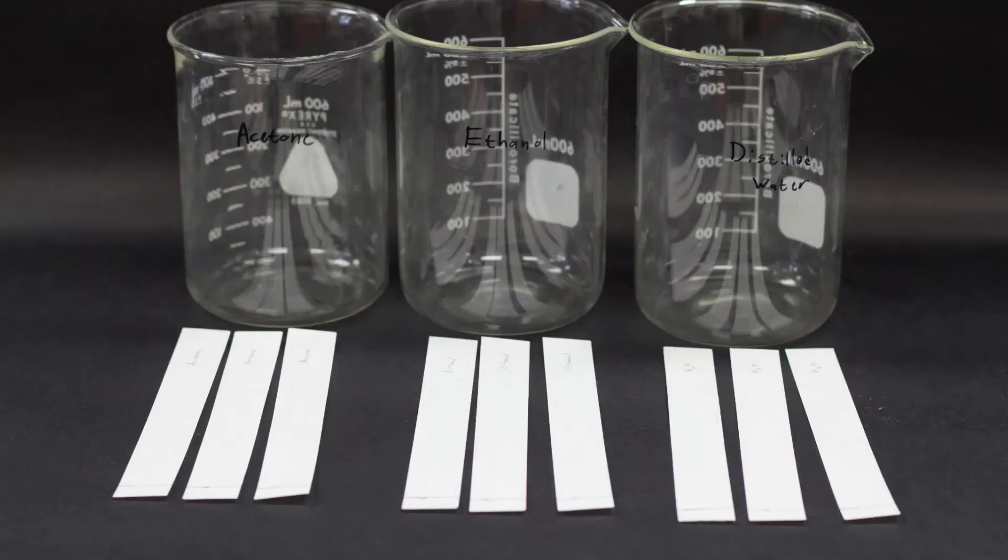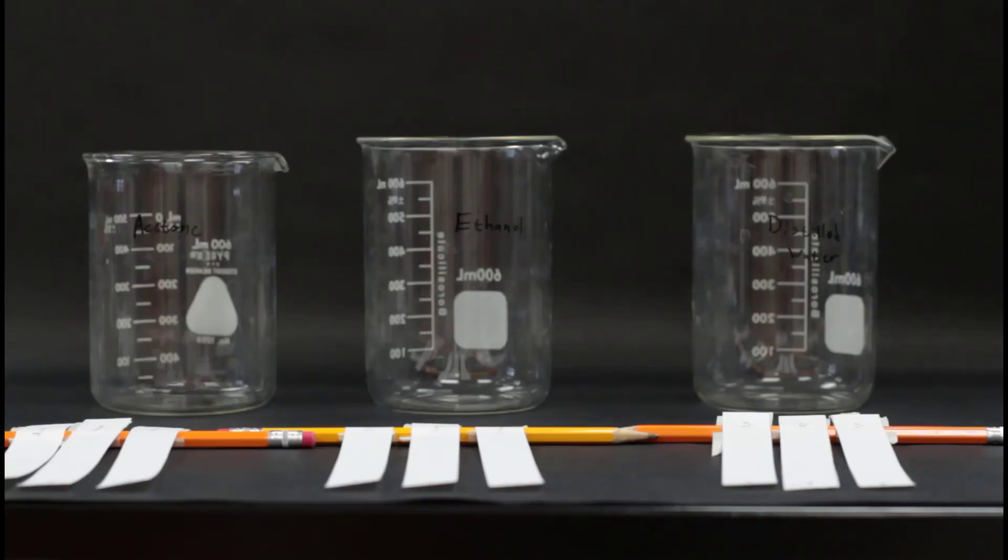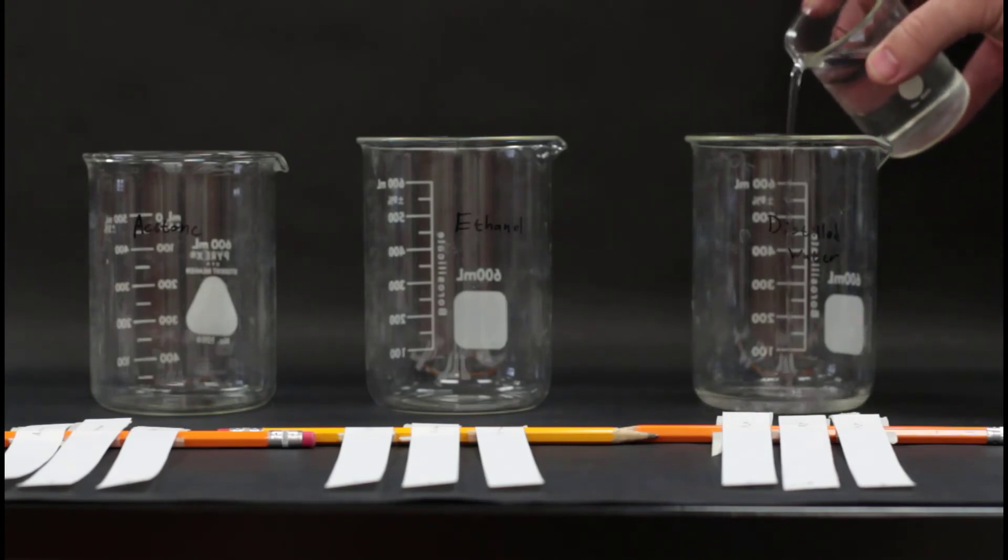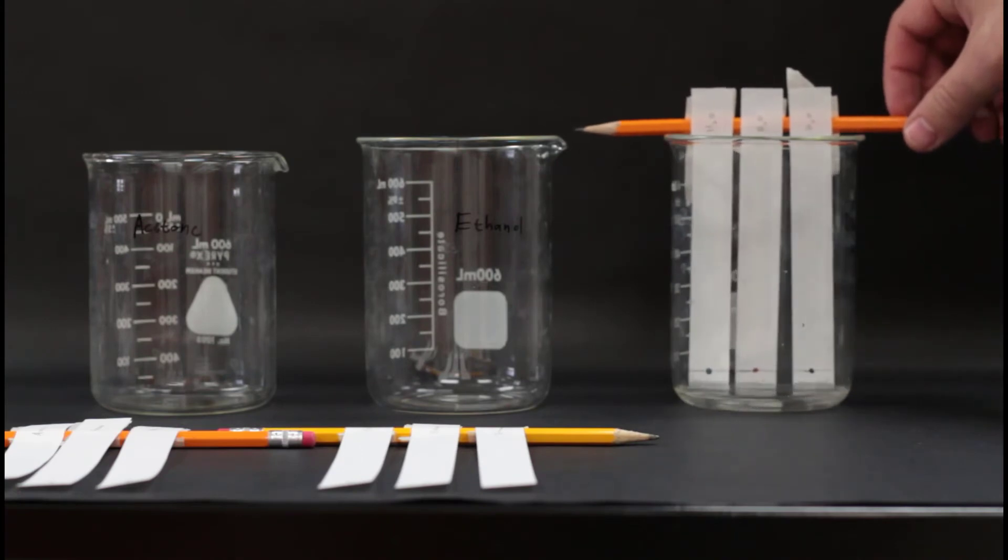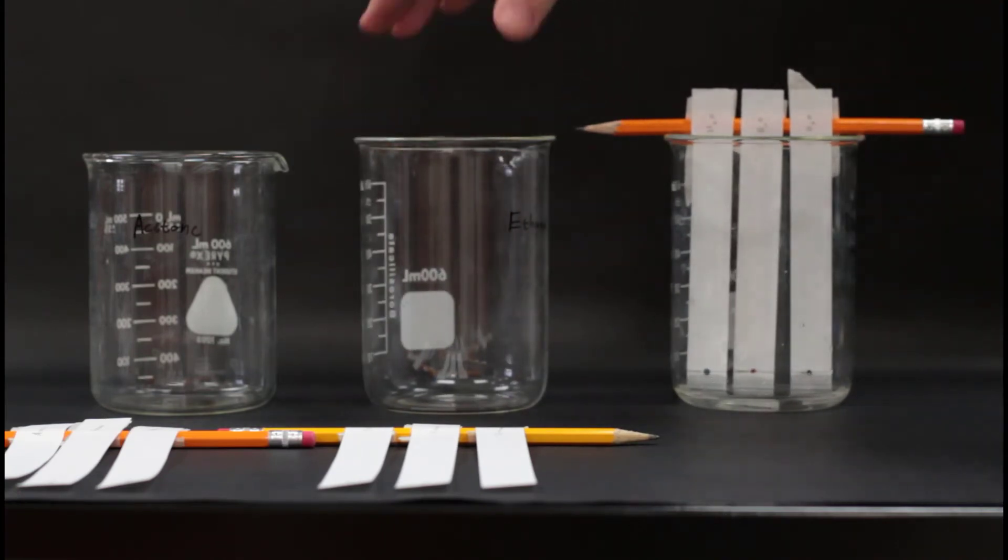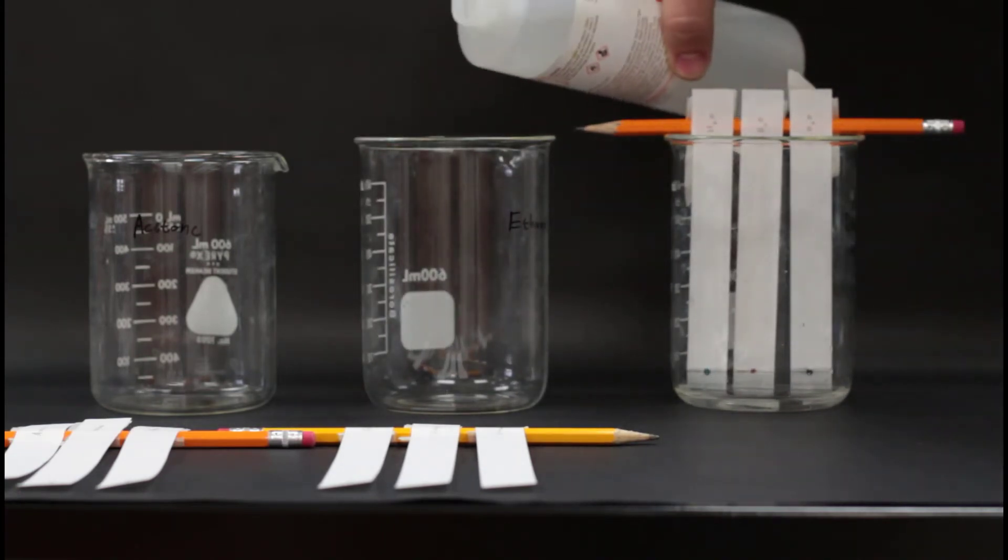Next, label each beaker with the solvent that will go in it. Once all three pencils and beakers are set up, pour the correct solvent into each beaker. One beaker should be for acetone, one beaker should be for ethanol, and one beaker should be for water.